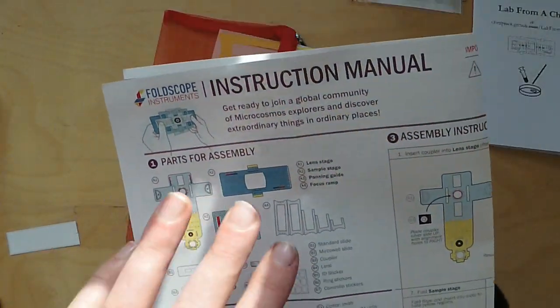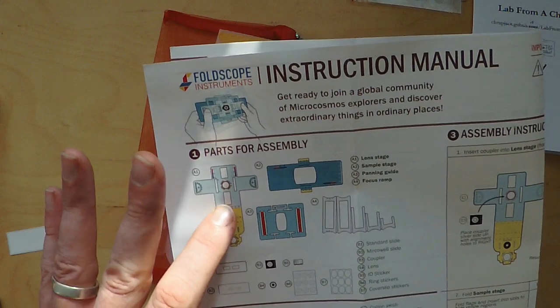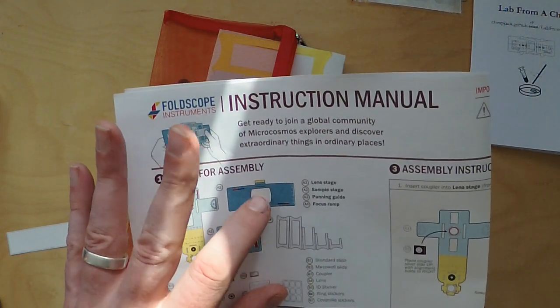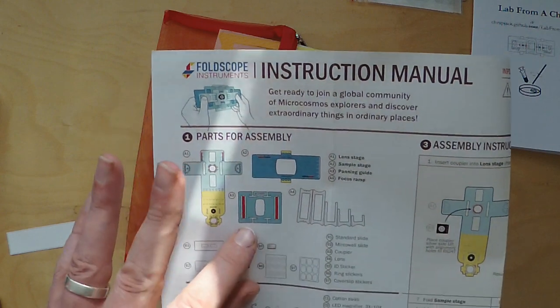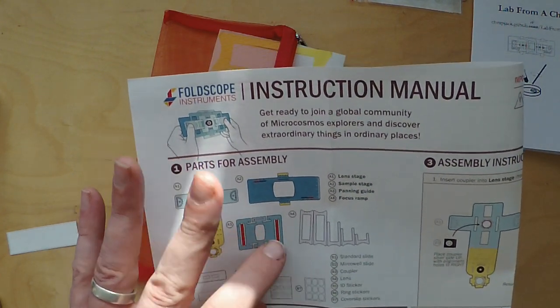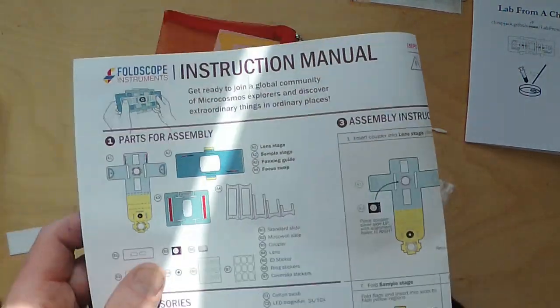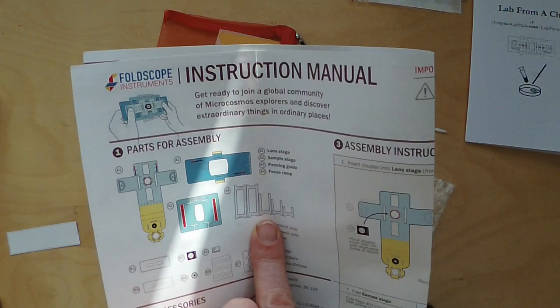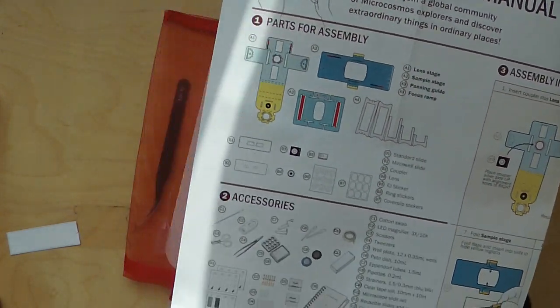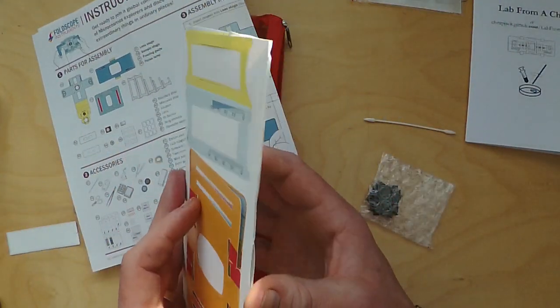So all of these components here - we have the lens stage, the sample stage where you can put your slides, the panning stage which allows you to move the sample around, and then the focus ramp which we'll go into in a moment. All of these components pop out of this big cardboard net.